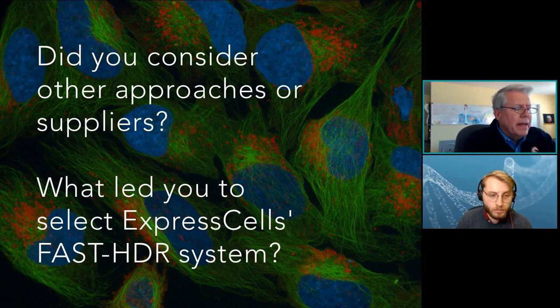So we'd work with a cell line that didn't have the endogenous gene. So it didn't have antigen G. It didn't have the particular HLA allele either. And so we thought, well, maybe that would be a simpler approach where we would take a null cell that lacked these different genes, and we would just knock in the whole gene. But at the same time, we felt that the more sophisticated way to create an isogenic cell line would be if we could modify the target peptide by the approach that I just described, which would be mutating a single amino acid residue within that stretch of amino acids which would make up the peptide. And we felt that would be the best way to demonstrate binding selectivity of the TCR-like antibody.